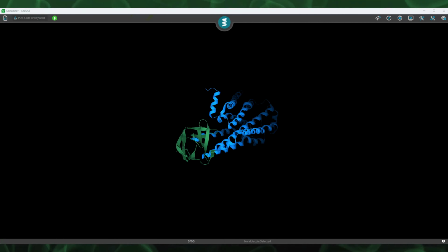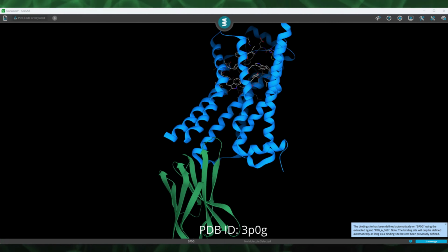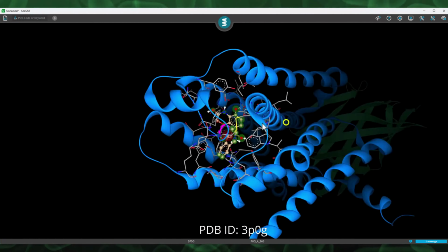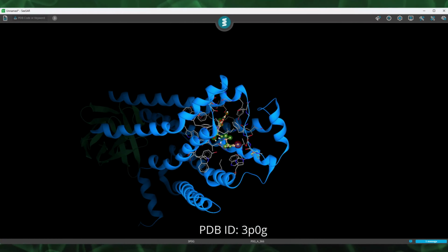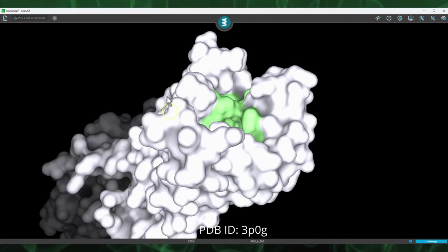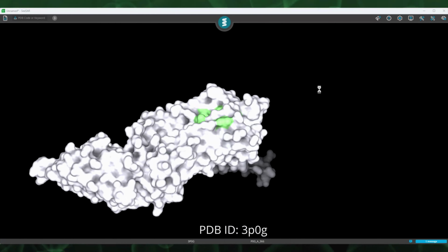The protein surface provides additional information beyond the secondary structure representation, offering insights into the global three-dimensional structure and the associated properties of the protein. So far in SeeSAR, the protein surface representation was restricted to the region around the binding site alone, but with version 13, we've extended this to the full protein.